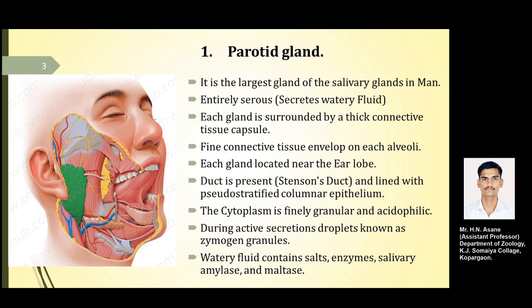The serous cells form the alveoli and are roughly pyramidal in shape. They rest upon the basement membrane, surrounding a narrow lumen.